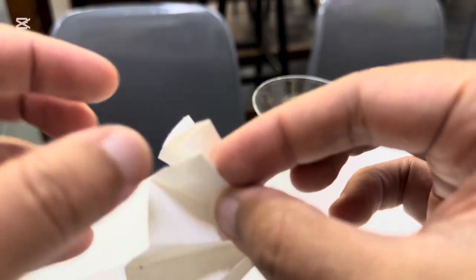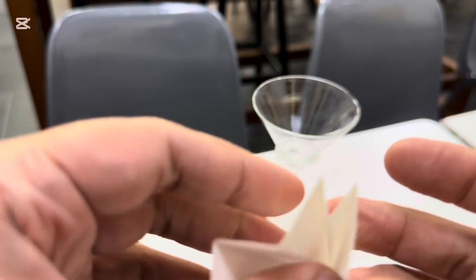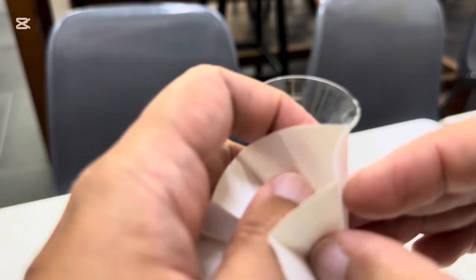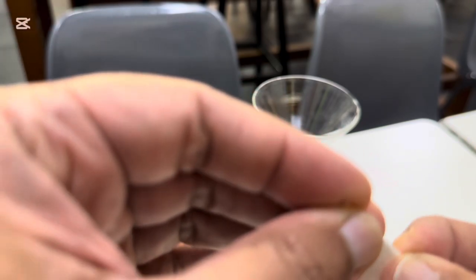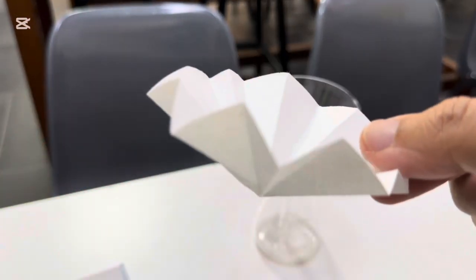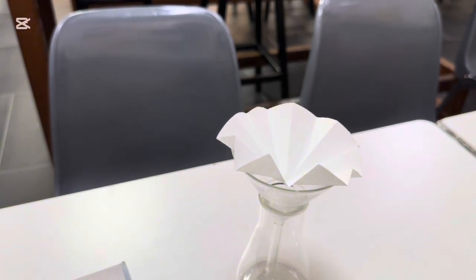Bend it and push it, and you should then be able to get a miniature up-down, which turns that into a triangle. Then do exactly the same for the other side. Now you only have two parts to do this final type of fold. Once that's done, you can place it into your filter funnel and proceed with your filtration.